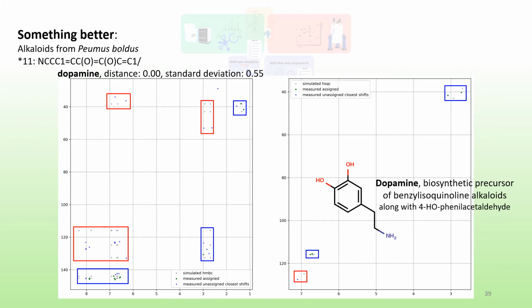Remember that we are only confirming the identification previously done using the mass spec routine, which is way more sensitive, and increasing the confidence for that identification. Mainly our goal is to overcome the intrinsic limitation of mass spec to assert the position of certain substituents.